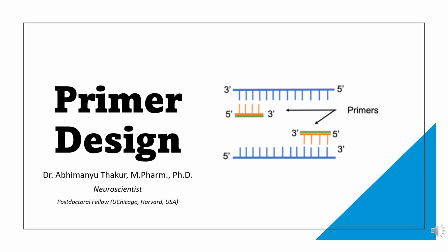Hi everyone, so today in this video I'll be talking about PCR and primer design, where I will highlight the critical role in modern biology and medicine, and we will be discussing the principle of polymerase chain reaction. You're going to learn how a primer can be designed, and we'll understand how it can be used in genetic testing, forensics, disease diagnosis and research.